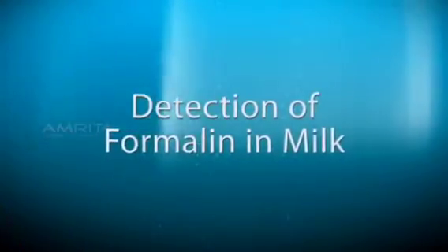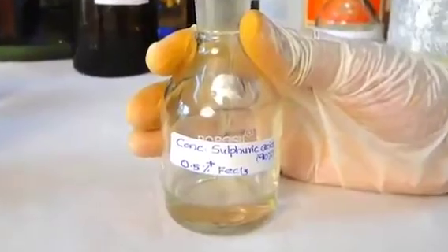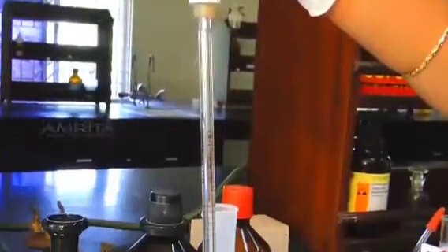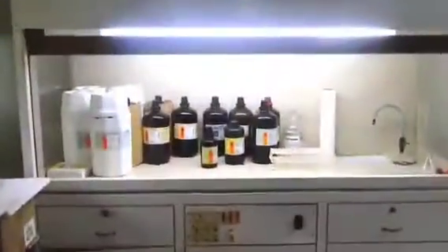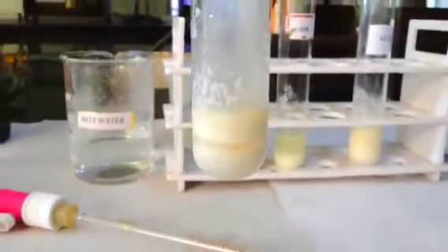Detection of formalin in milk. Pour 2 ml milk into a test tube labeled formalin. To this, add 2 ml of 90% sulfuric acid containing ferric chloride using a glass pipette. This step should be done in the fume hood. A purple-violet ring formed at the junction indicates the presence of formalin in the milk.